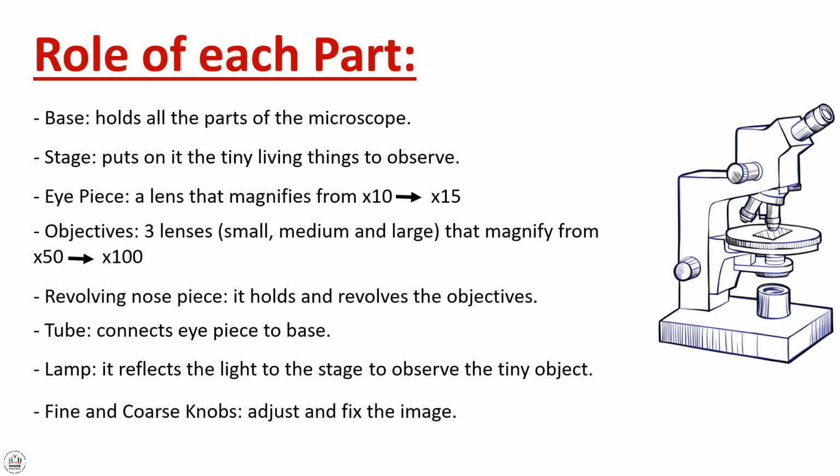And finally the fine and coarse knobs, they adjust and fix the image. Okay.